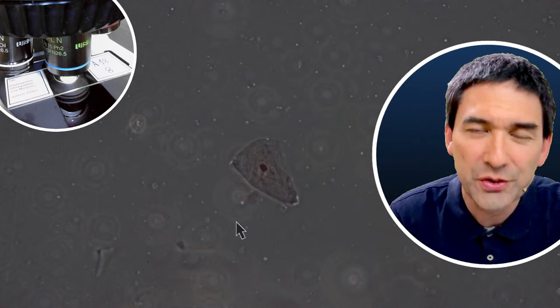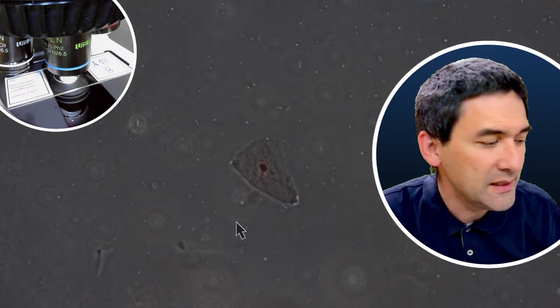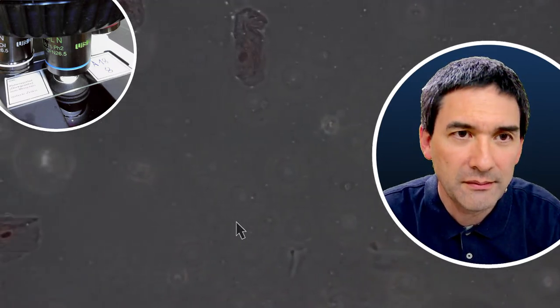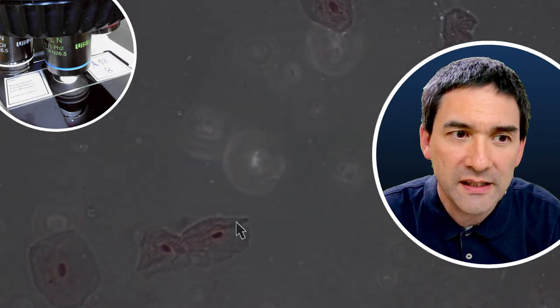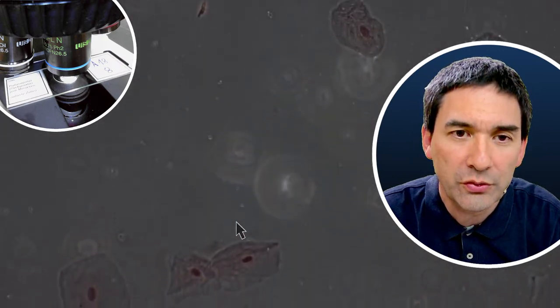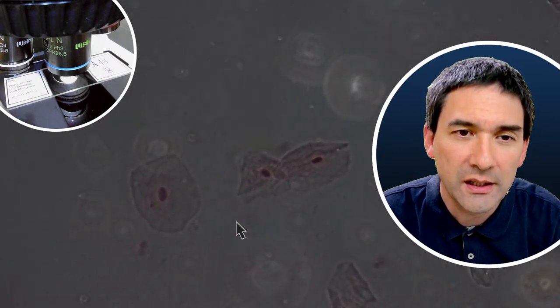But honestly, I was not so happy with that slide. Okay, but still, I think it's a nice example of a very difficult to observe slide of very low contrast. So not all commercial slides are actually good. Here are a few more cells.